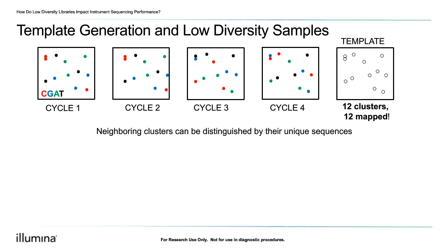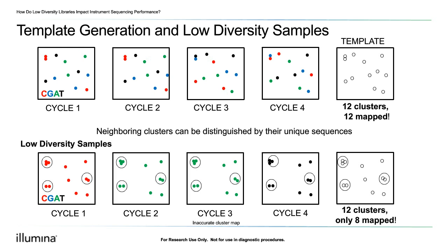In each cycle, the signal from the clusters is recorded and used to generate the template map that reflects the physical location of each cluster on the flow cell. Once this template map has been generated, it's used throughout the sequencing run. Because template generation uses the unique series of base calls during the first few cycles, it is most efficient with high diversity libraries. For a low diversity library, clusters that are closely adjacent will show the same sequence and the instrument may map these groups as a single cluster, reducing the raw number of clusters mapped.